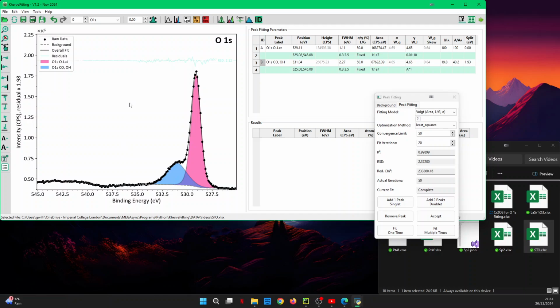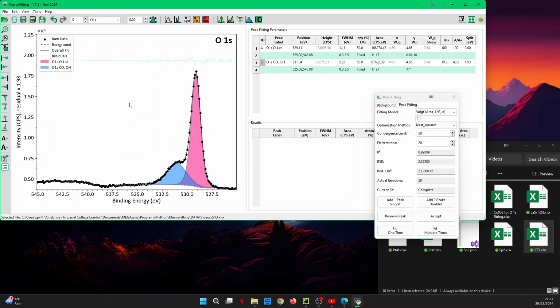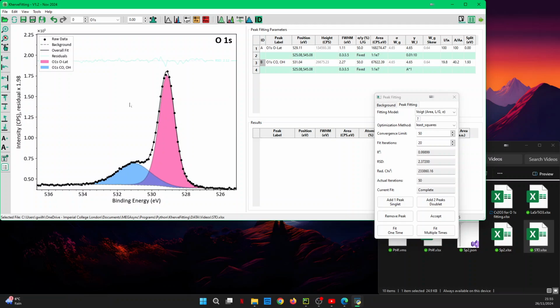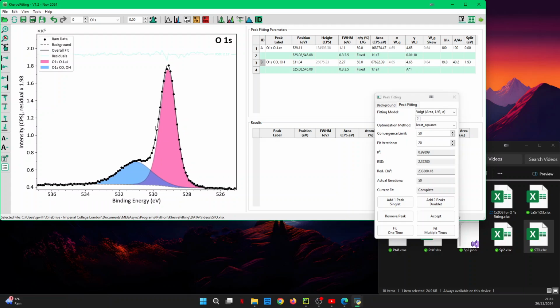So I can use something like the shift. In here, by the way, I was using the Control left or right brackets to shift between each peak, but I may decide to do the shift left, and now I can move. I can just zoom onto the oxygen 1s because I've got nothing in here. Okay. I may decide to do the same for the others.